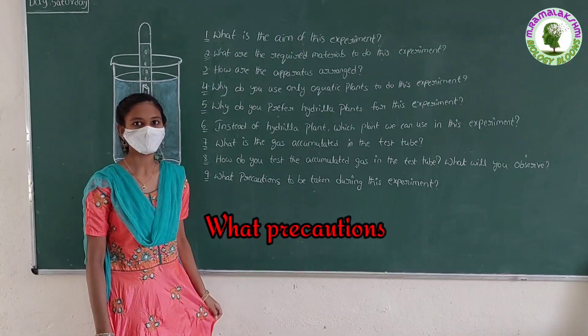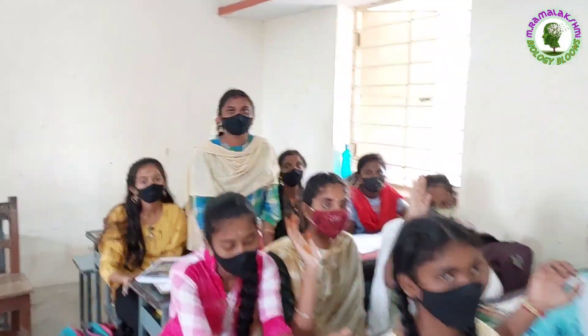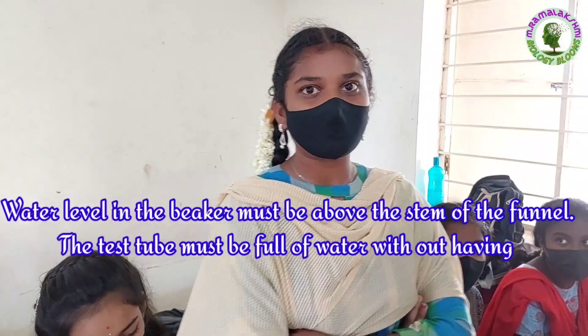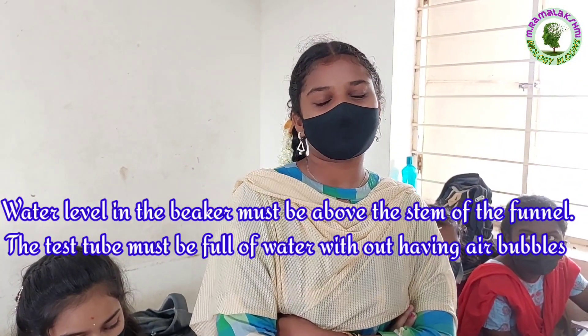What precautions are to be taken during this experiment? Akshaya: The water level in the beaker must be above the stem of the funnel. The test tube must be full of water without air bubbles.